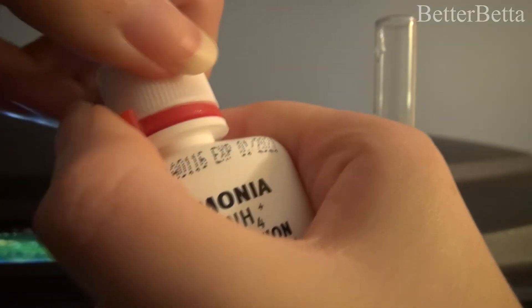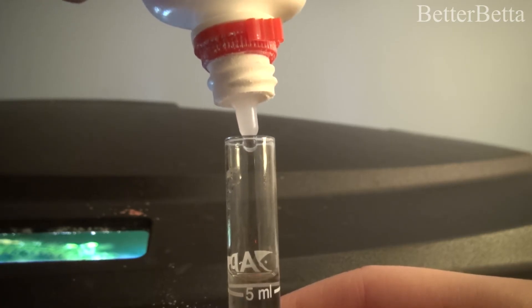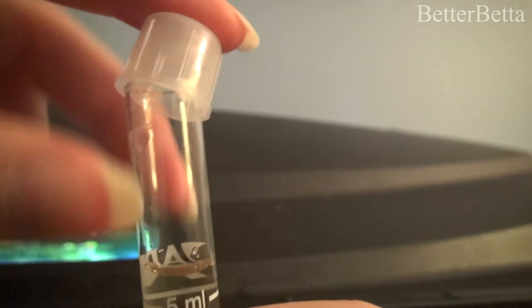Now the next step is you're going to want to add another eight drops of test solution two. When you've added eight drops of each test solution in the correct order, you're going to want to put the cap on your vial and shake it vigorously. This will accurately mix up the chemicals and make sure you get the chemical reaction that you want.